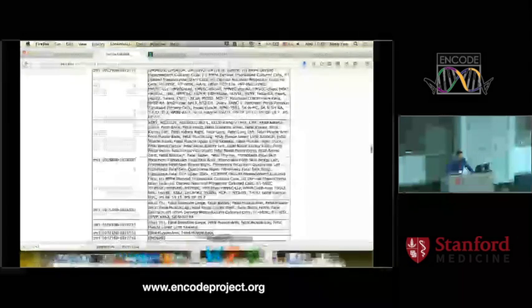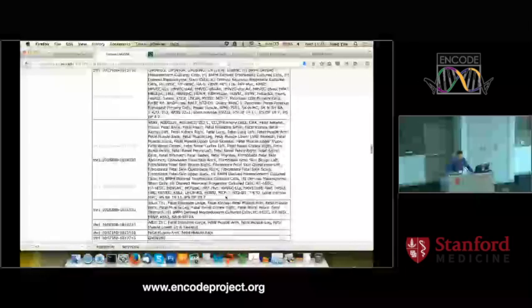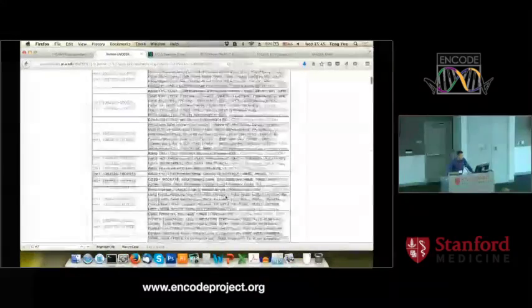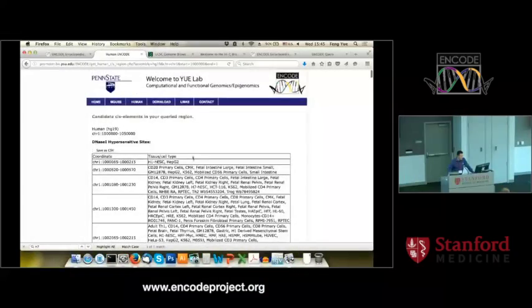Okay, pretty straightforward function. Option three — say you forgot the gene loci.